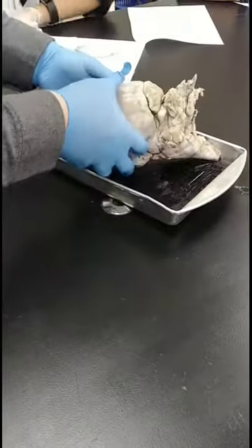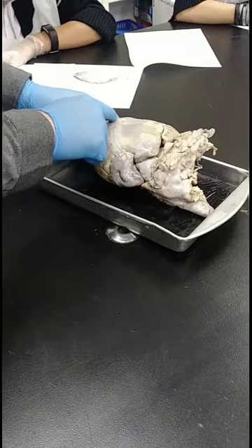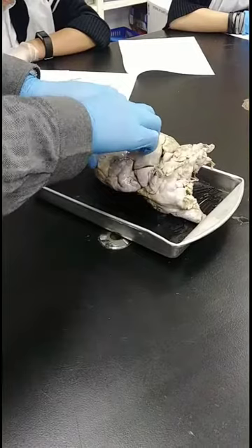Okay. So here's the front of the heart, the anterior side. Here's that groove we were talking about the other day, right? Interventricular sulcus, the groove. So this is all the left ventricle, and the right ventricle is smaller. You can press on it and feel that there's a chamber in there. It feels a little hollow.